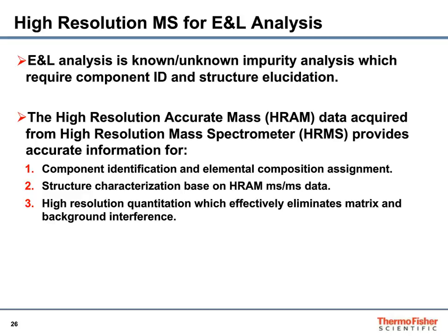Because by the time you need to do quantitation, most likely those compounds have some toxicology concerns. So being able to lower your LOD is very important.